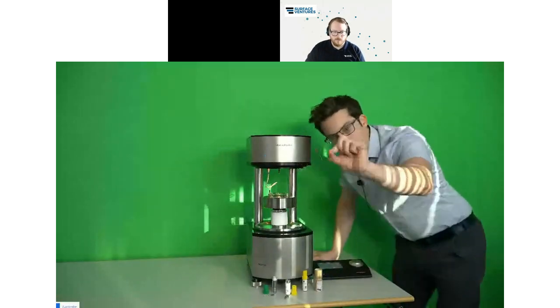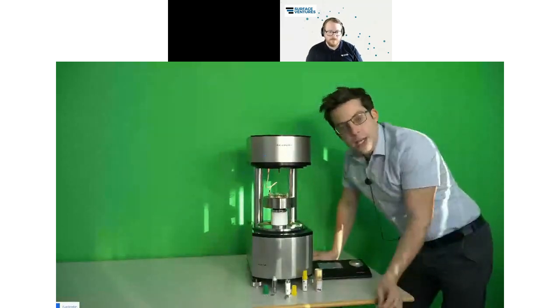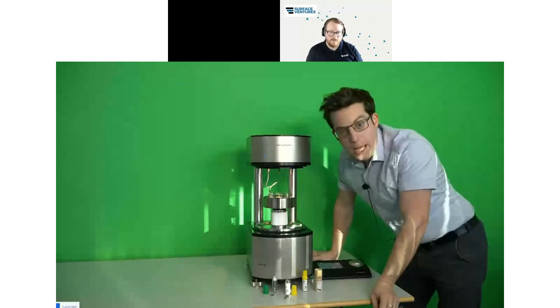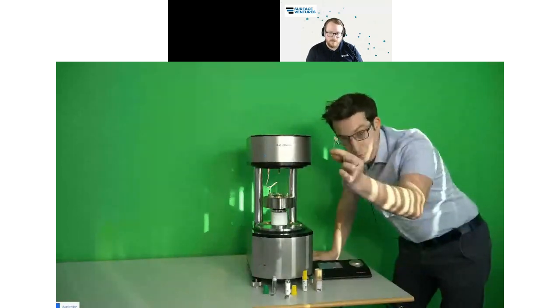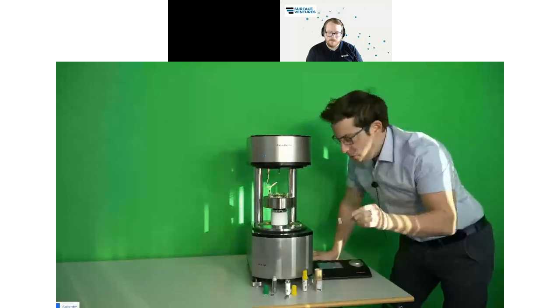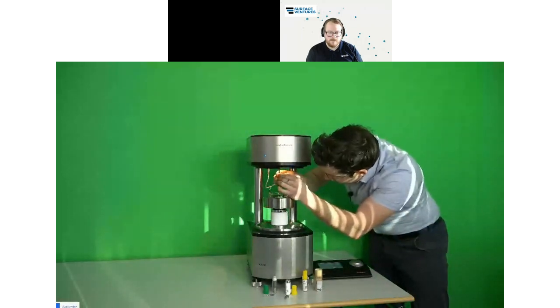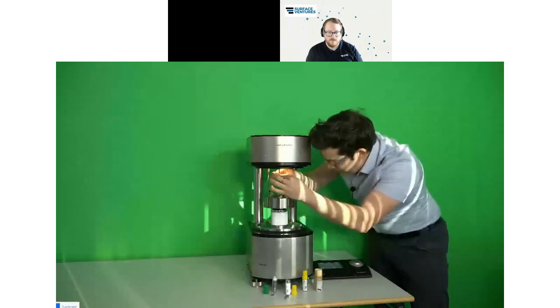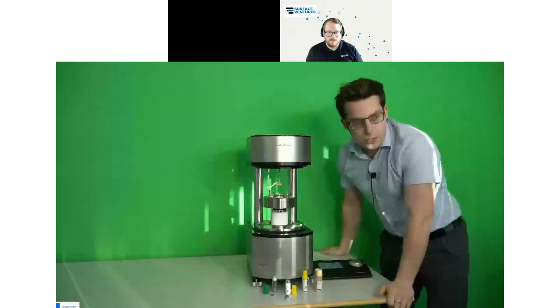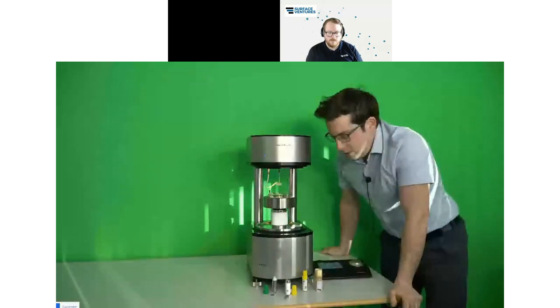I have in my hand a so-called Wilhelmy plate. This is a plate made from a platinum iridium alloy, and this is our probe that we are using to study surface tensions, for example, of a liquid. The system is quite simple. You just slide this plate up here. I turn it in your direction so that you see it well. And now the device is ready to do the measurement.